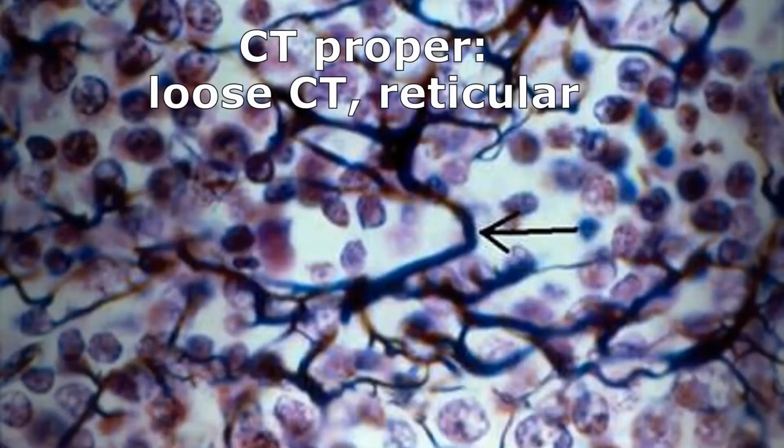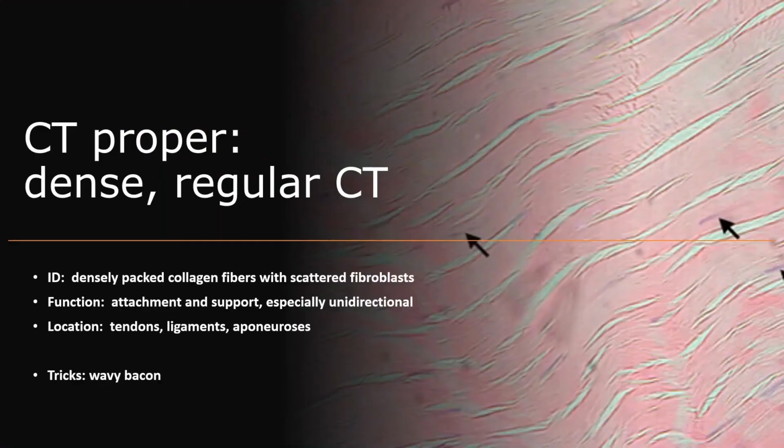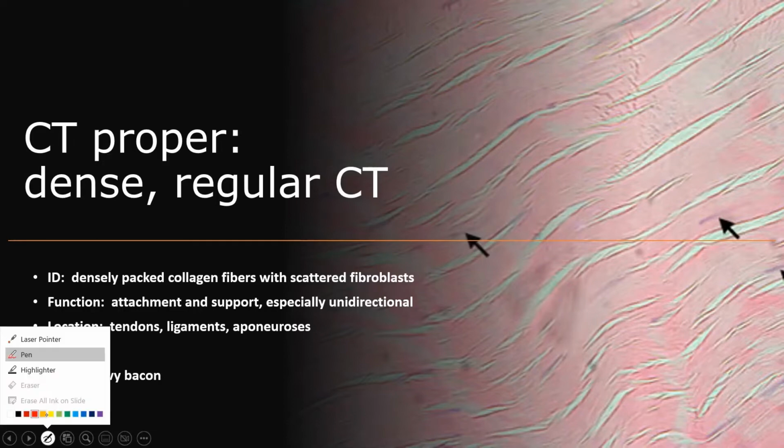Very close up now, we're really close, and that arrow is pointing straight at a branched reticular fiber. Remember, again, it's a collagenous fiber, it's collagen, it's not made of elastic. So cherry blossom, cherry blossom. That's what I see again. I see a forest of cherry trees and the blossoms are falling. This is reticular tissue.